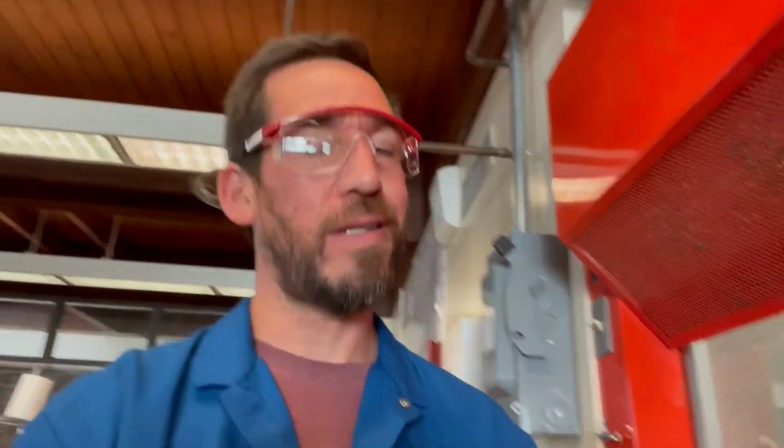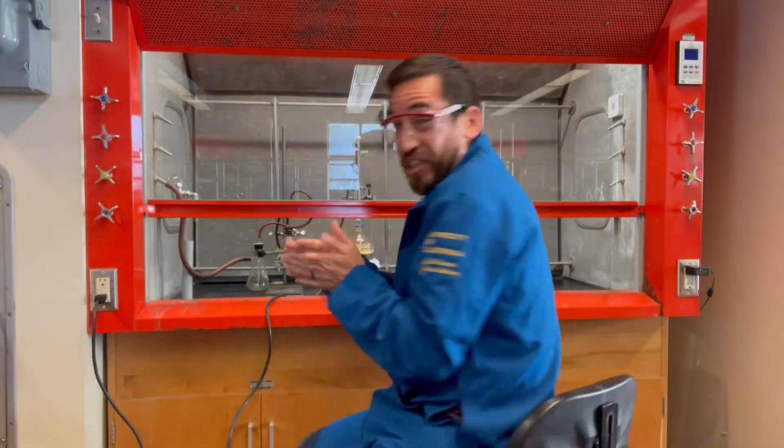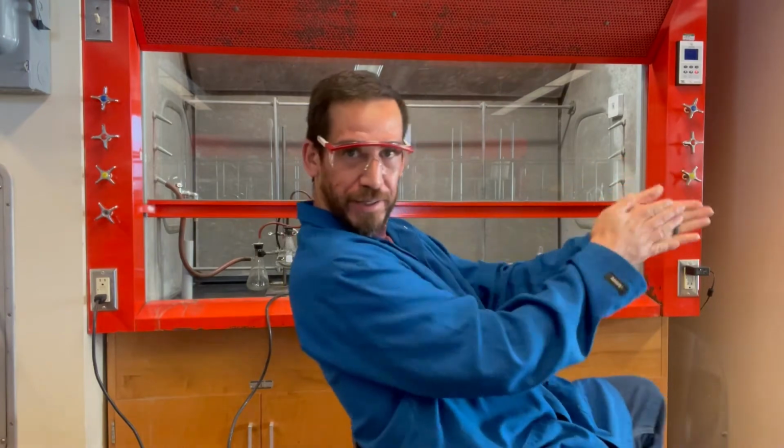Okay, so for real though, you can't start the timer for the hour until it reaches 70. So we're going to go ahead and wait, and then I'll check with the thermometer periodically, and then we can get the timer started. It's almost to temperature, which is good.